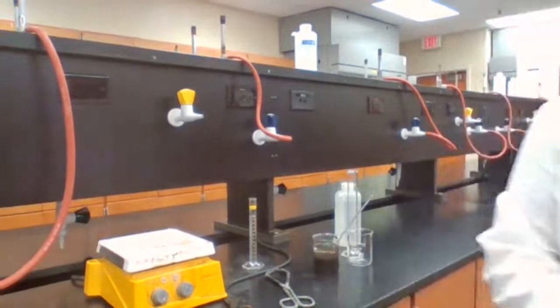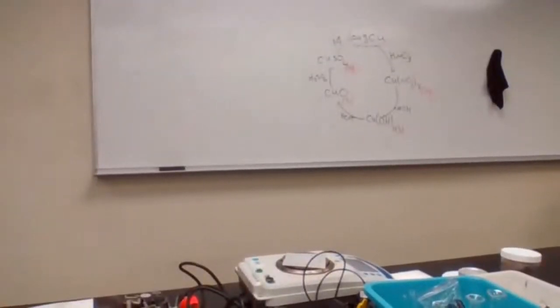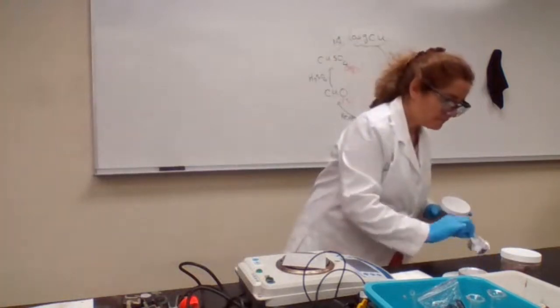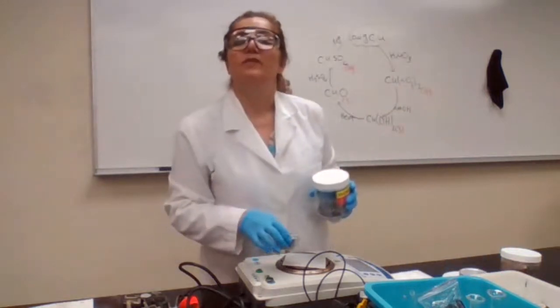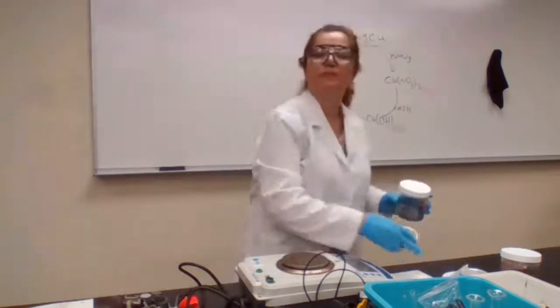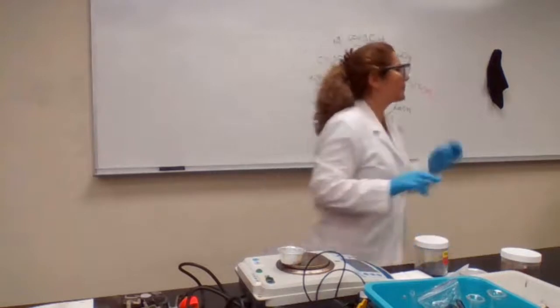Okay, let's take the camera to the other way, turn it around, and measure. How much of magnesium is that? Is it 2 grams or less? Of the magnesium. How much? 1 gram magnesium? Okay.